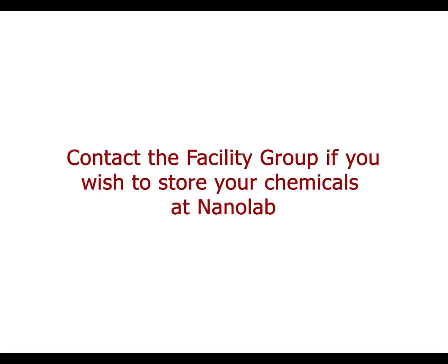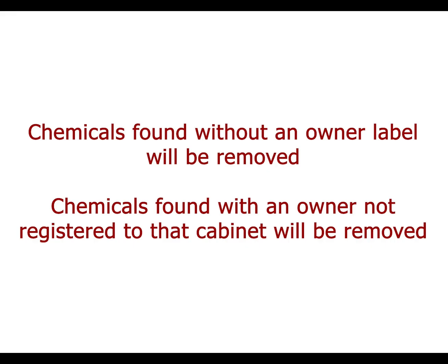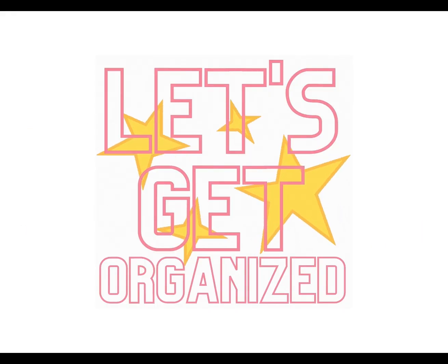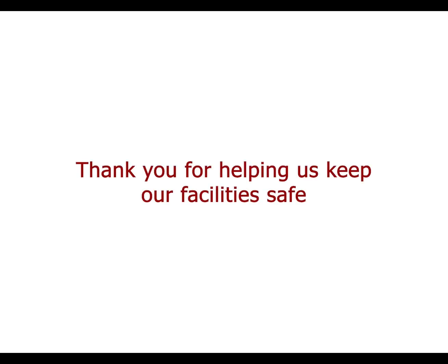We'll help you figure out if you need a shared shelf or a personal shelf. A fair warning: you can only store chemicals in the cabinet you're registered to. If we find something where it doesn't belong, it's getting removed. Space is limited and chemicals can be dangerous, and we're working hard to keep things organized and safe. Help us out by following the system, not making it harder.